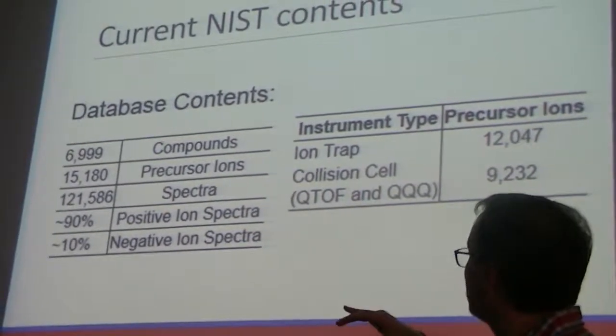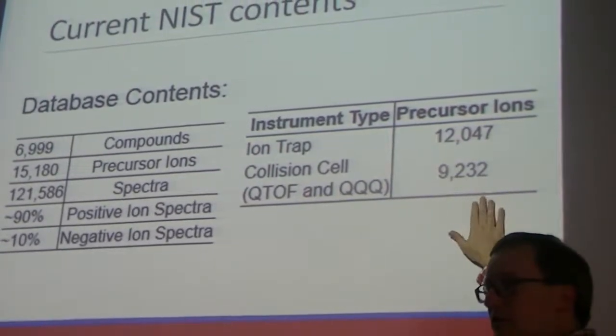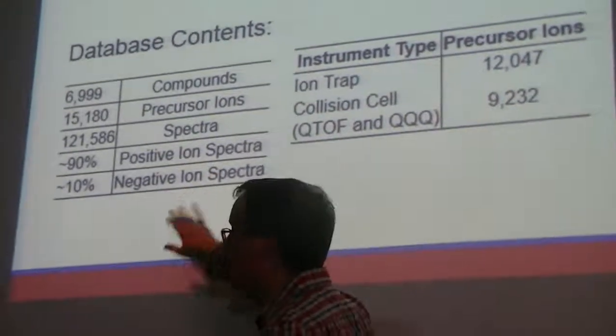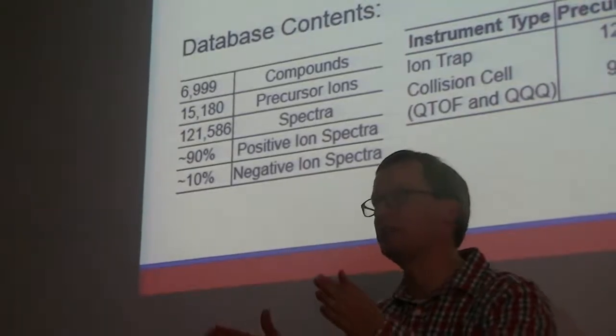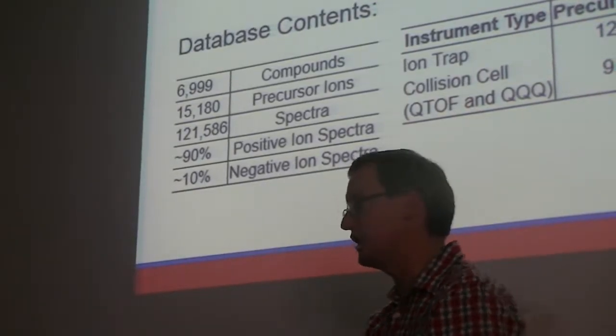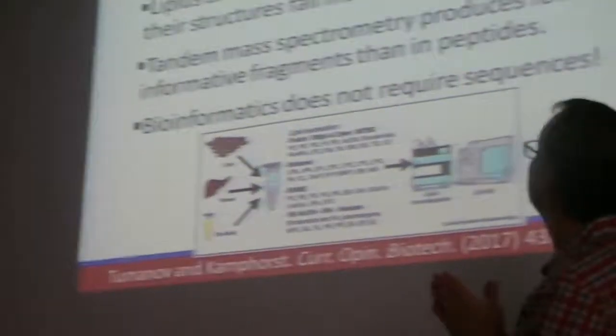They had precursor ions measured for quite a few of them. Here you can see the numbers of tandem mass spectra that they generated as well. They generally work in positive ion spectra, but it's worth noting, although I spend all my time thinking about protons on ions, that you can also strip them away. You can also produce negatively charged ions. So they measure in both polarities.